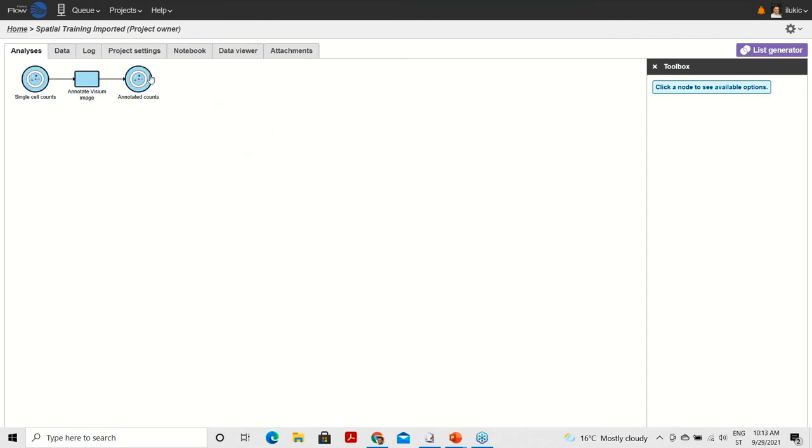And here we go. This is our result, the annotated counts data node. When you mouse over, the balloon shows you some basic descriptive information. We have 2 samples inside. The total number of tissue spots is just under 7,000, and the total number of features is about 18,000.